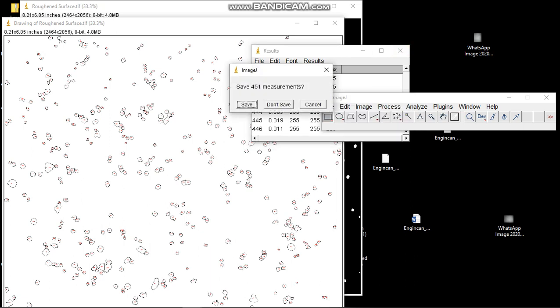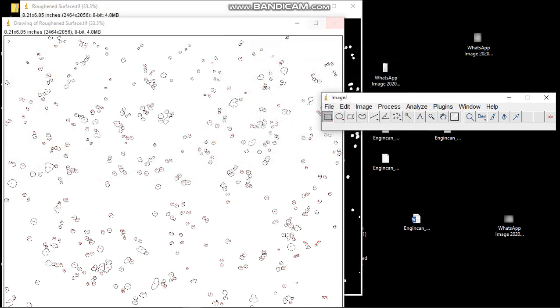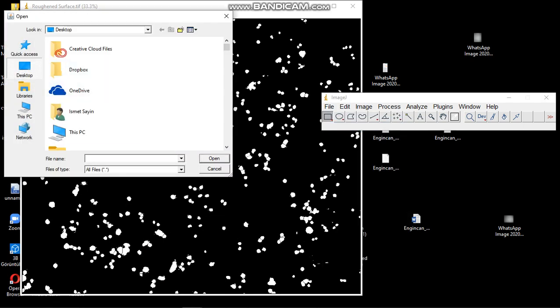After that, we save it to the desktop, and we close it. Now we will do the same process for the other surface.